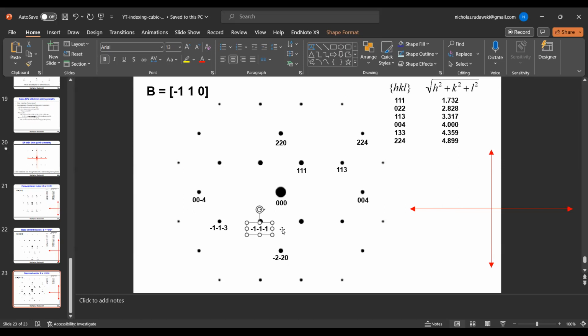All right, so let's do a few more here. How about this guy right here? So the slides that you're seeing are actually taken from a course that I taught, how many years ago was it? 5 years ago, on TEM. So I did a whole graduate course on TEM, and so I had these slides already prepared. So it was fairly easy to kind of put all this together.